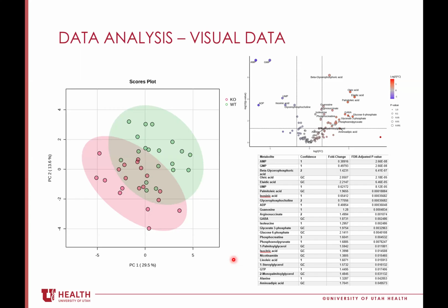I'd always be looking for a cross data set approach that could let us see important patterns, and have a discovery resource where people could look up and put in some signature that seems to be differential and then relate that to other pathways. Some of that's built into MetaboAnalyst, I know, but how much could we grab all of your data sets and start to string those together across different studies and sample types, and really start to see subpatterns that we think might relate to cell type and species?